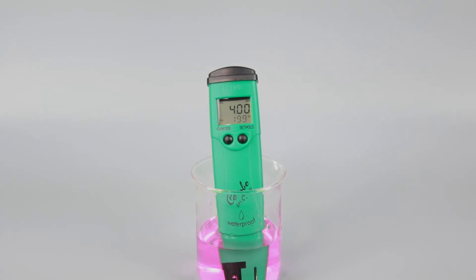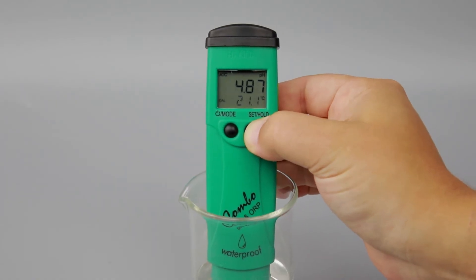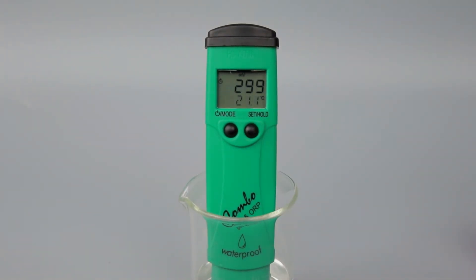The HI98121 combo tester is equipped with an ORP sensor. While taking measurements, press the set hold button to switch between pH readings and ORP readings.